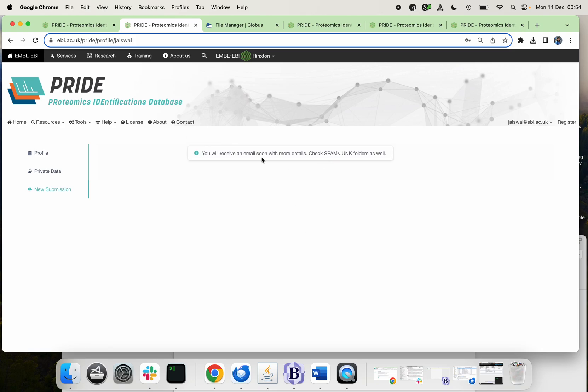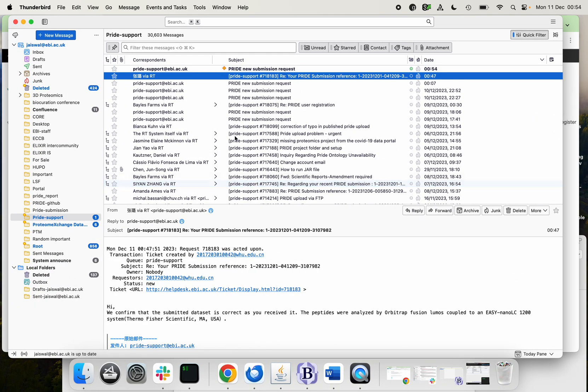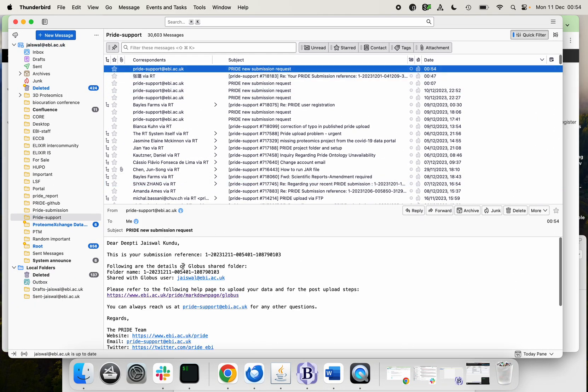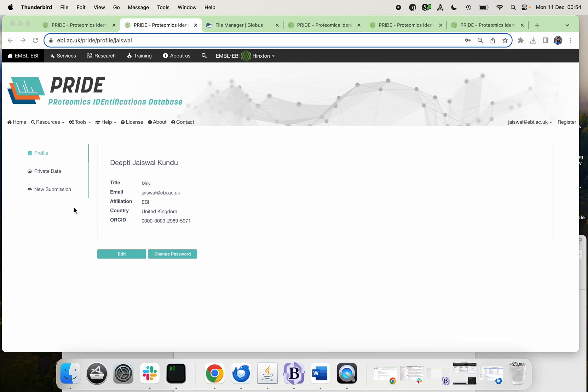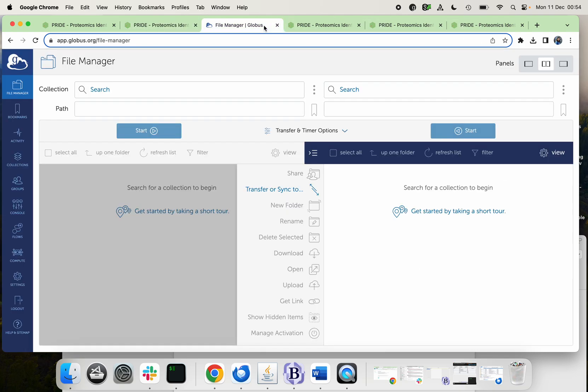So here it says that we will receive an email soon in our inbox, and you can see that the ticket has been generated. Now again come back to your account and you can see that it also appears here. Now you need to go to your Globus account and click on the file manager.